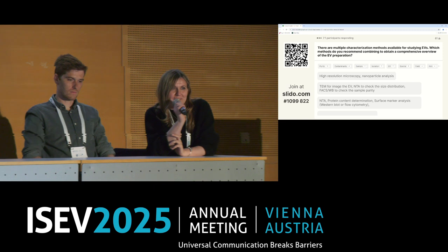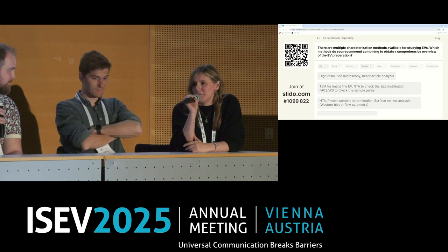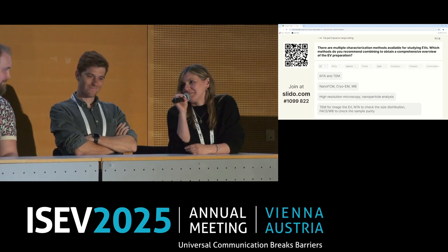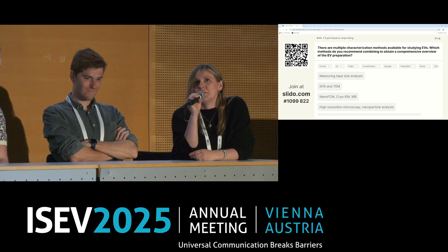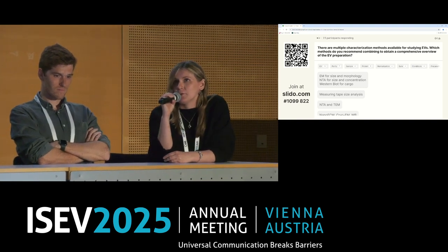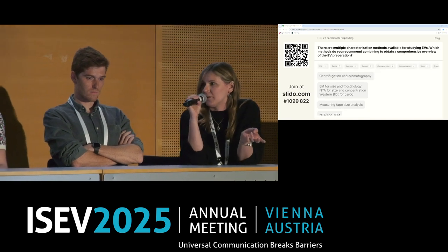What I usually tell people when someone comes and has basically all the instruments and asks what should I do: I can suggest you use them all and never get the results you expect, because each method is very unique, and the design of your experiment and how you characterize depends on scientific questions. What do you want to learn at the end of your study?